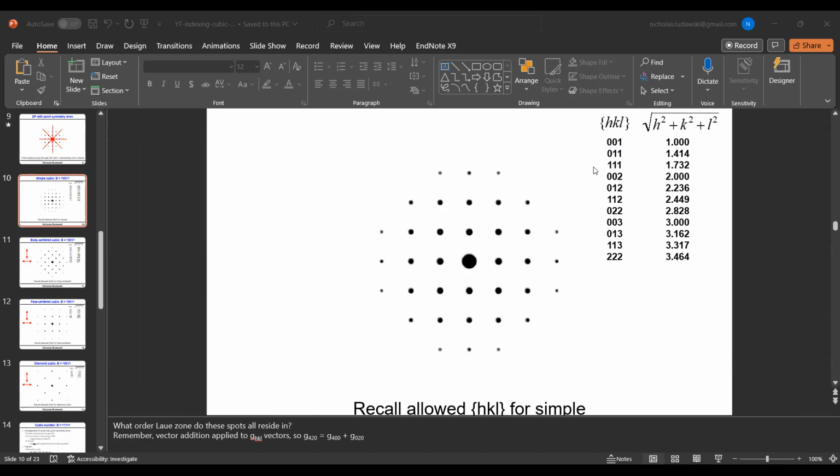So G2 has to also be in that same family, because they're the same length. The question now is, can we assign indices to G1 and G2 so that I get a 0 dot product with them being in this family? And the answer, of course, is yes. I can do that very easily.